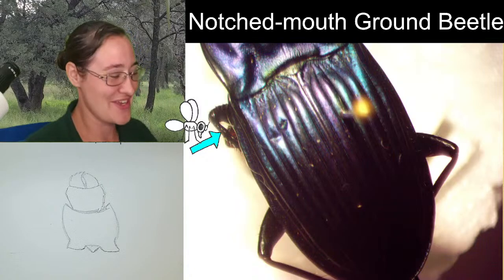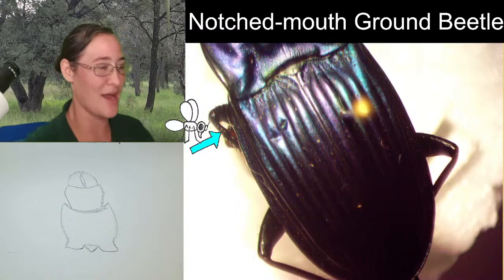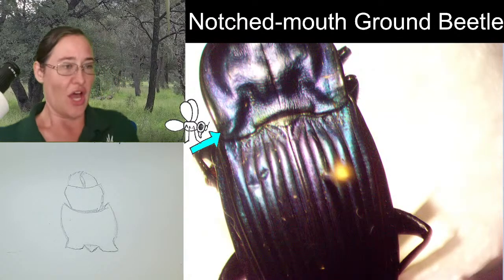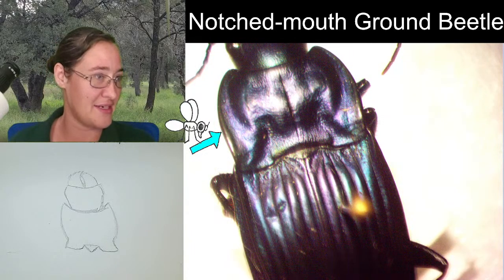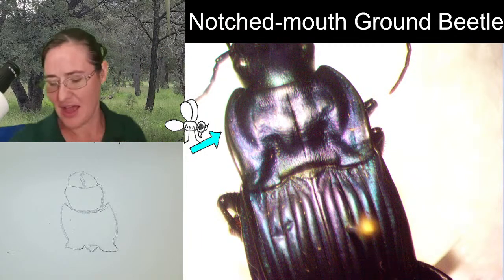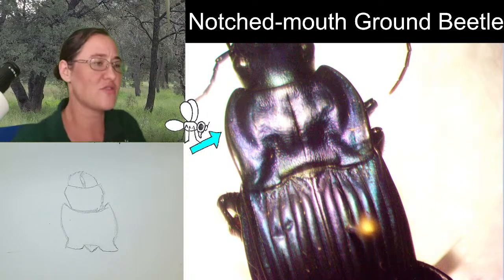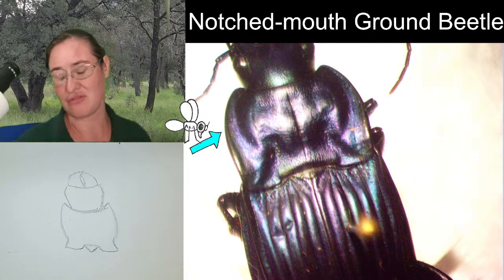Okay, I think that that's where I was. Two characteristics that help you identify it. You can see that it has a very unique body shape. For ground beetles, it's kind of wide and convex feeling. It doesn't have a narrow space in between the pronotum and the elytra. It doesn't have a neck region at all. It's kind of just flat and wide. So it does have a fairly unique body shape.